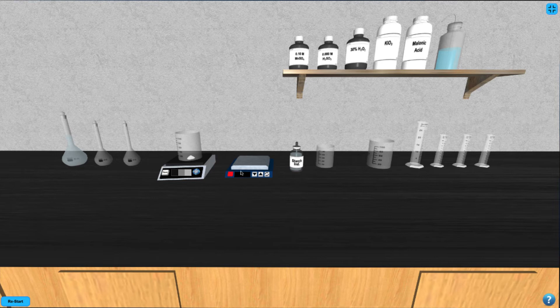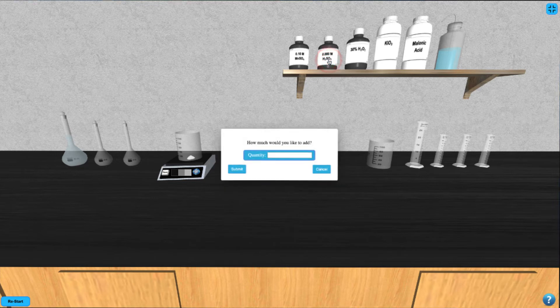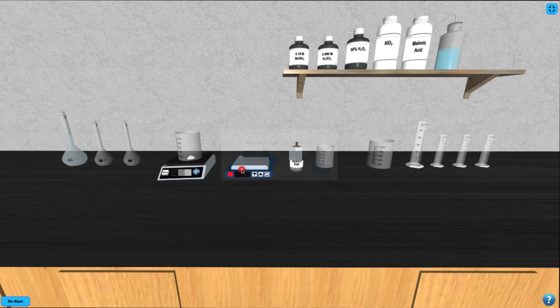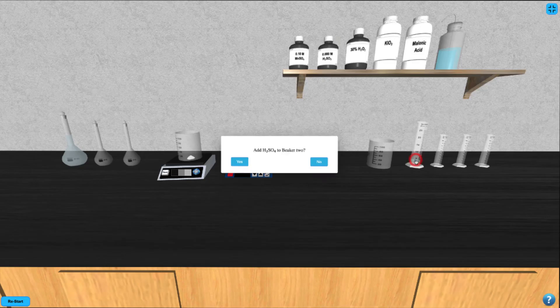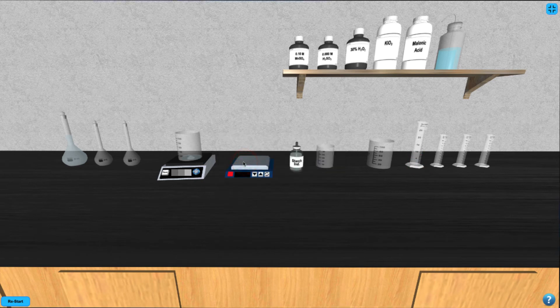Next, click on the sulfuric acid bottle and enter the volume of sulfuric acid you wish to add into the volumetric flask in units of milliliters. This volume will be added into the 25 milliliter graduated cylinder, so click on it to subsequently add it to beaker 2. Then click on the beaker to move it to the hotplate.